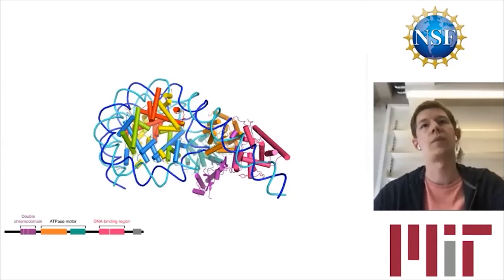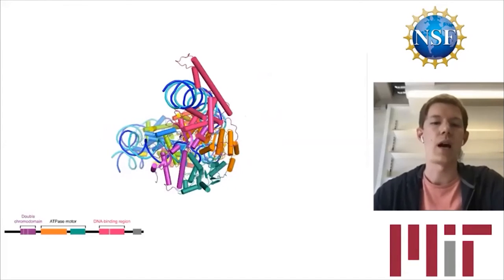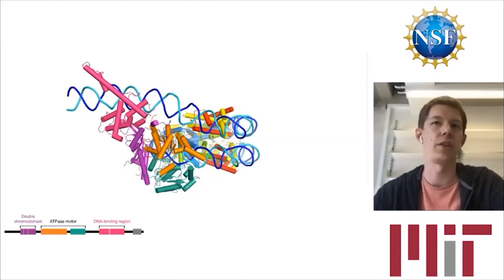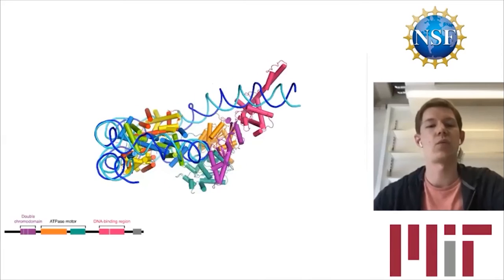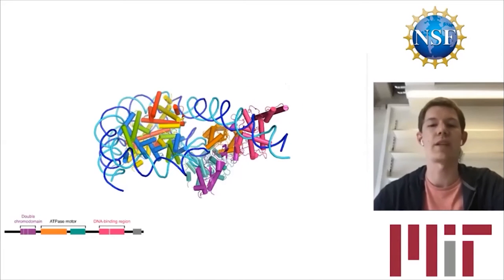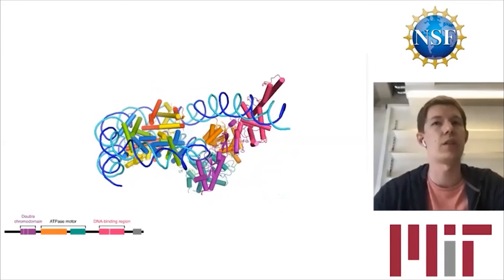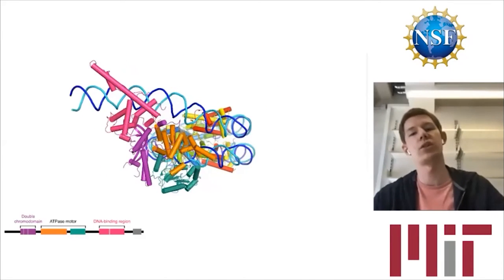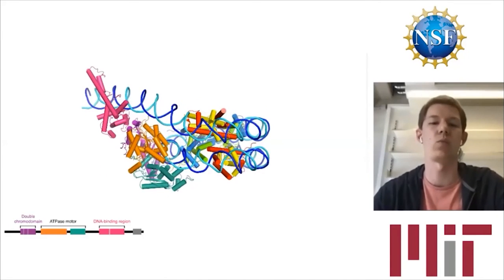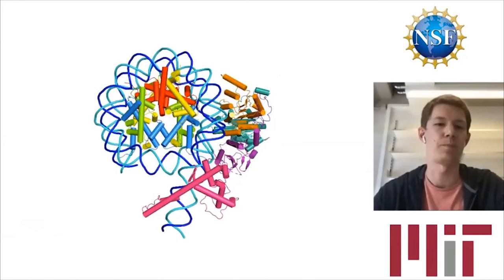And using already existing crystal structures as well as de novo modeling, I was able to obtain the final structure that you see here rotating right now, where you can see that Chd1 interacts quite extensively with DNA on one side of the nucleosome. Specifically, Chd1 binds with its ATPase motor at superhelical location +2, while the double chromodomain binds closer to the dyad at superhelical location +1 via a basic patch interaction with the backbone of the DNA.